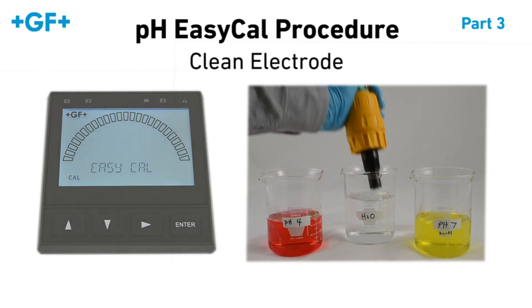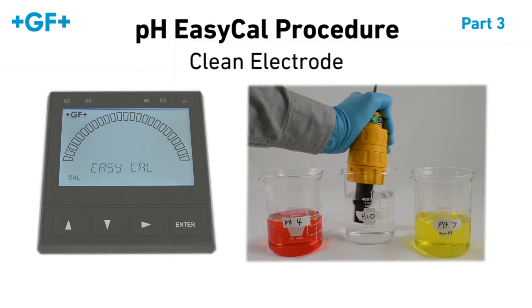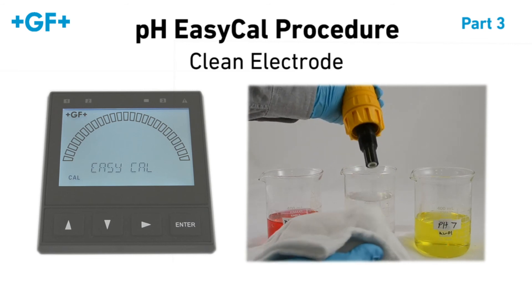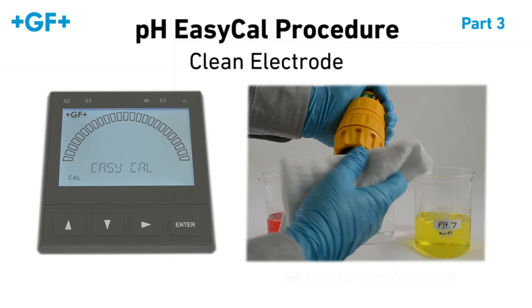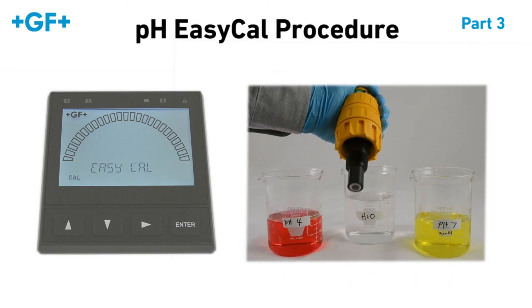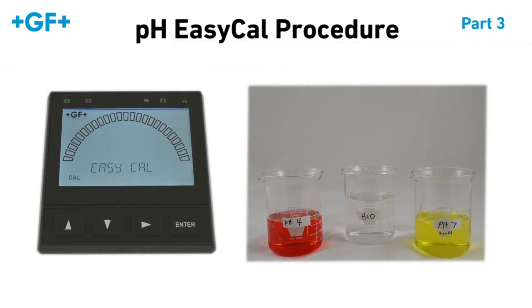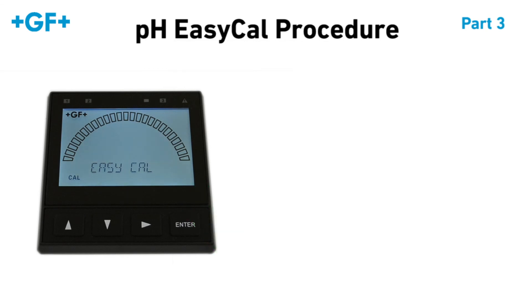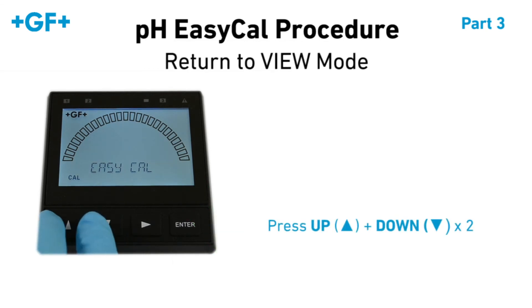We'll have to clean the electrode one last time before placing it into your application or into storage. Pat dry with a non-abrasive cloth, being careful not to scratch the glass tip. You have successfully completed the pH EasyCal process. Press the up and down arrows at the same time twice to exit the Cal menu and return to View mode.